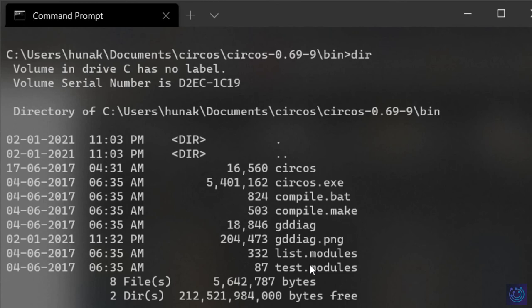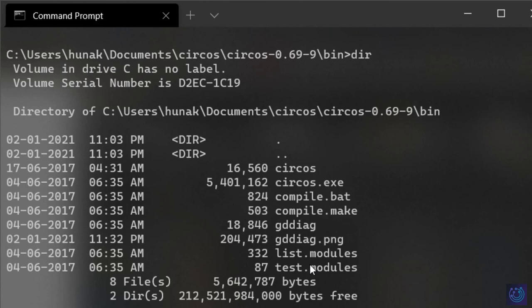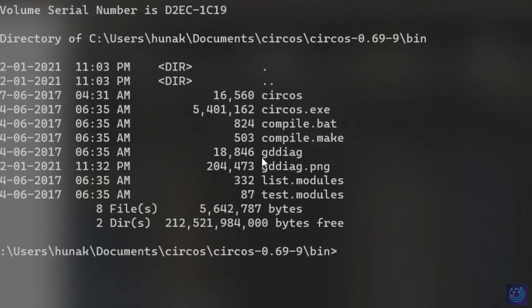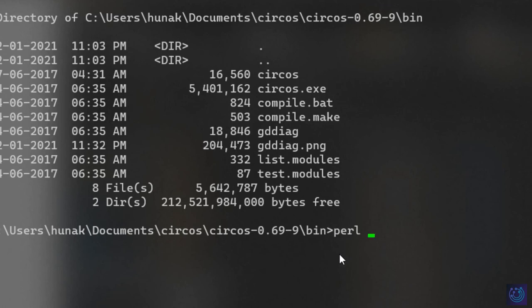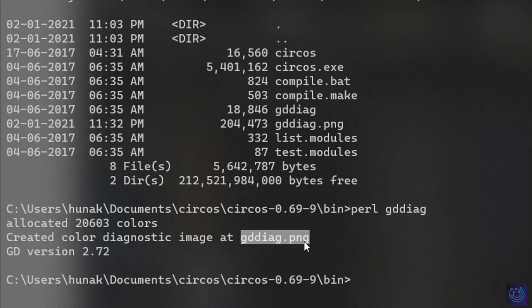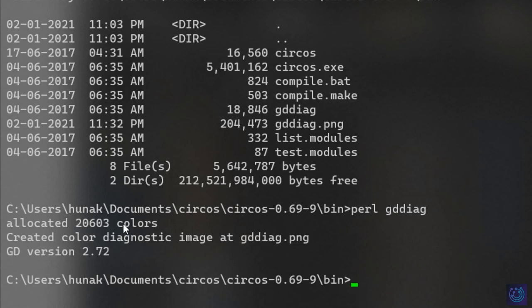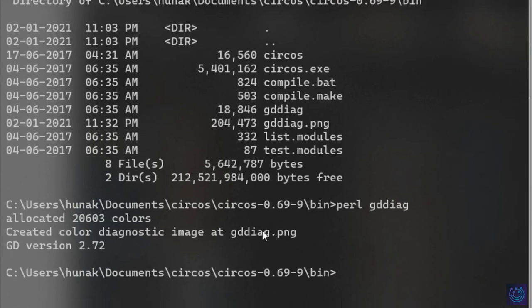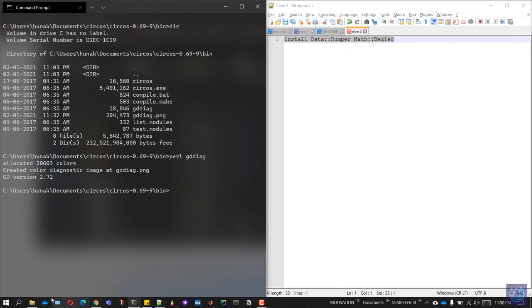The next command we will be running is gddiag. This again is a Perl file, so type in pearl and gdd and tab to autocomplete. After this, hit enter. If you get a prompt saying that it has generated an image named gddiag.png, that means the command was successfully run and this is the output.